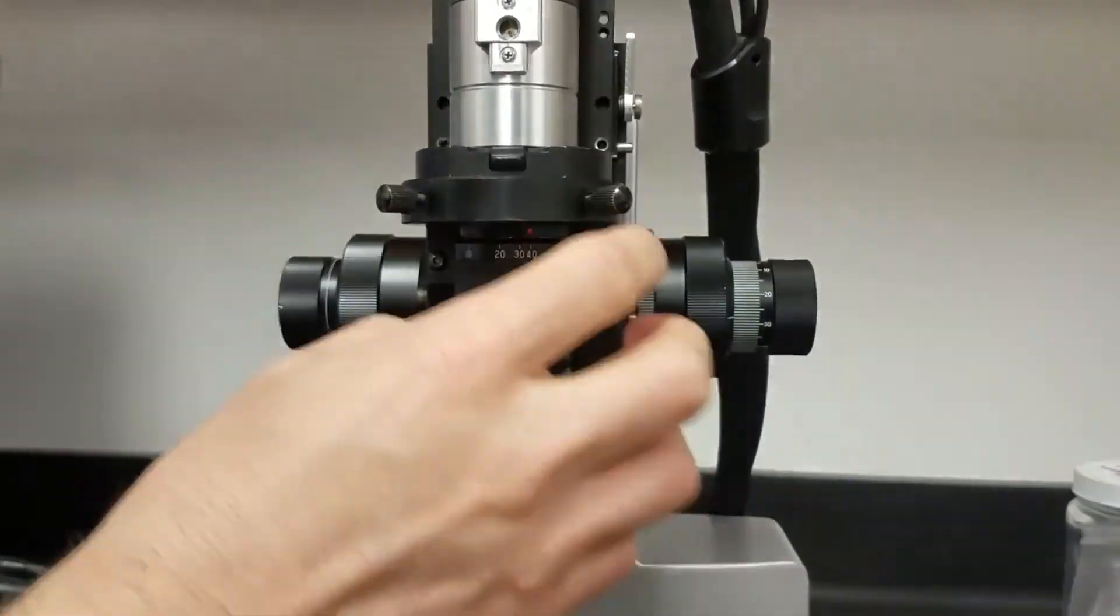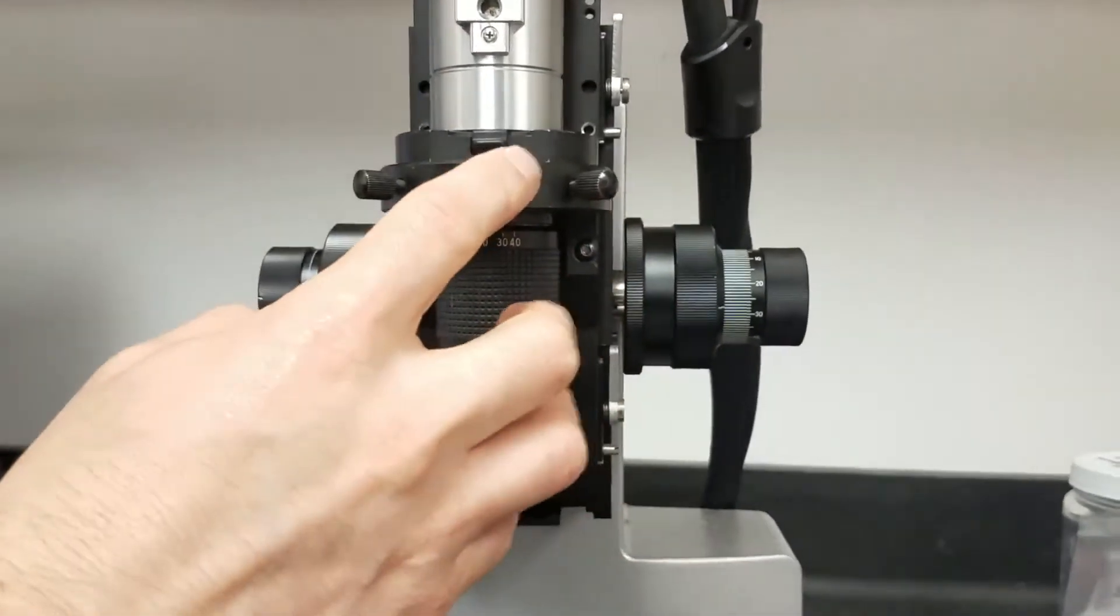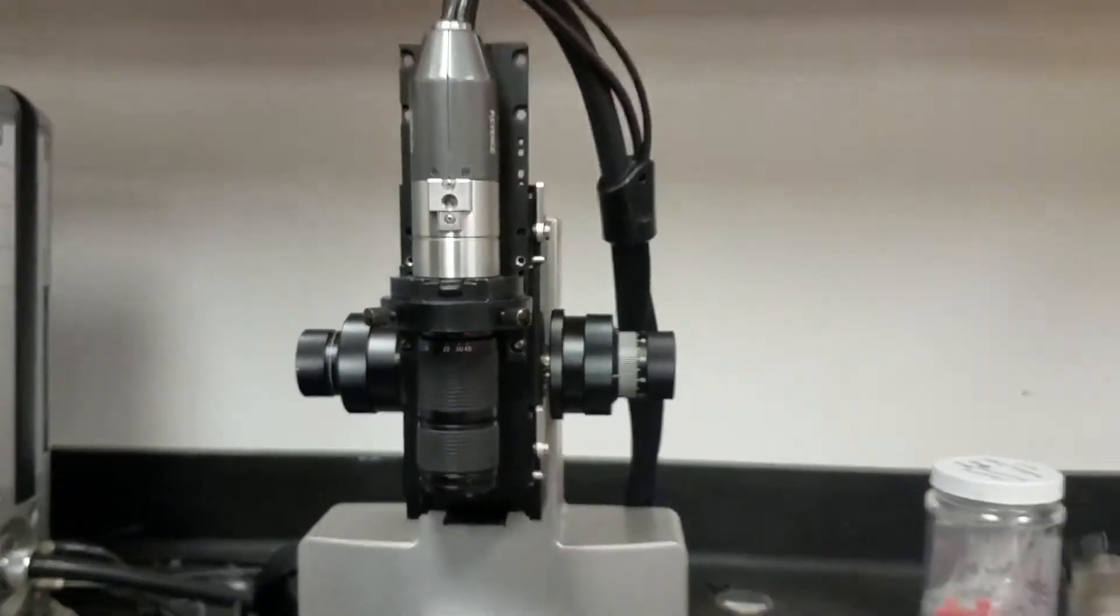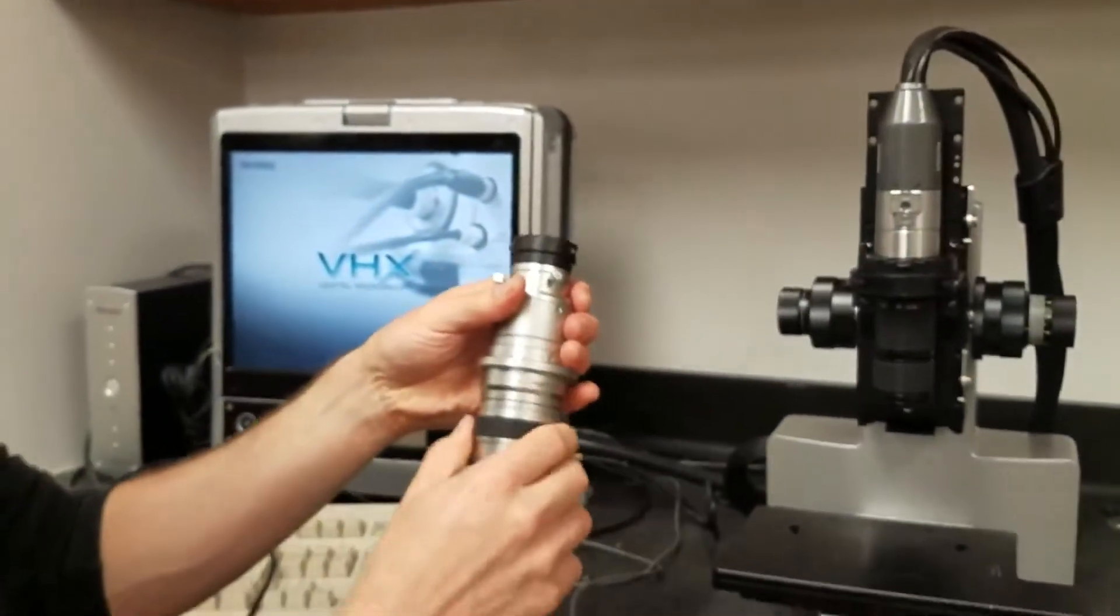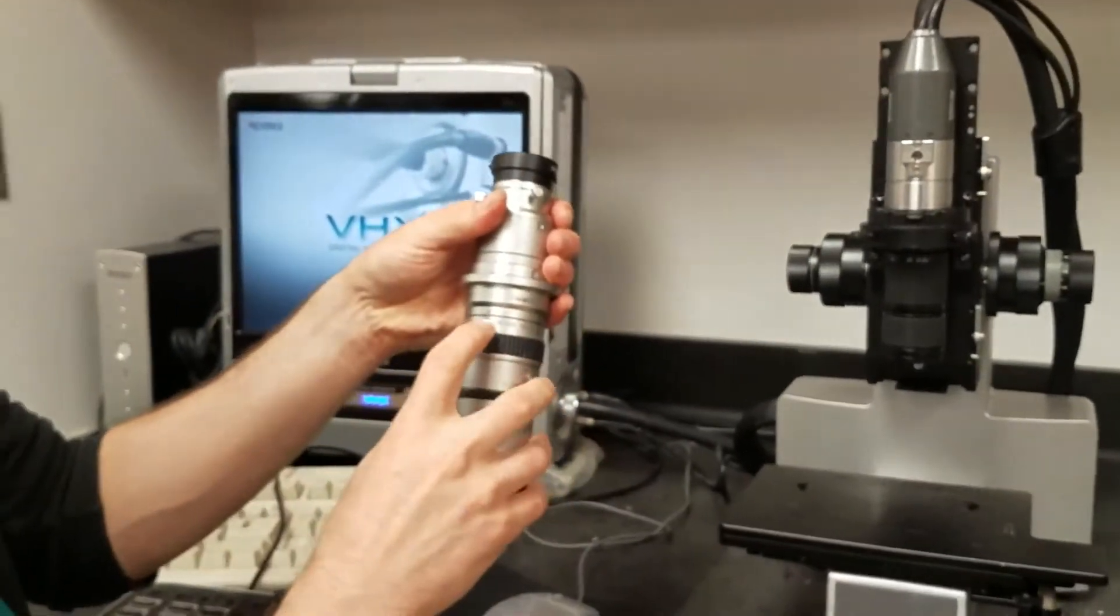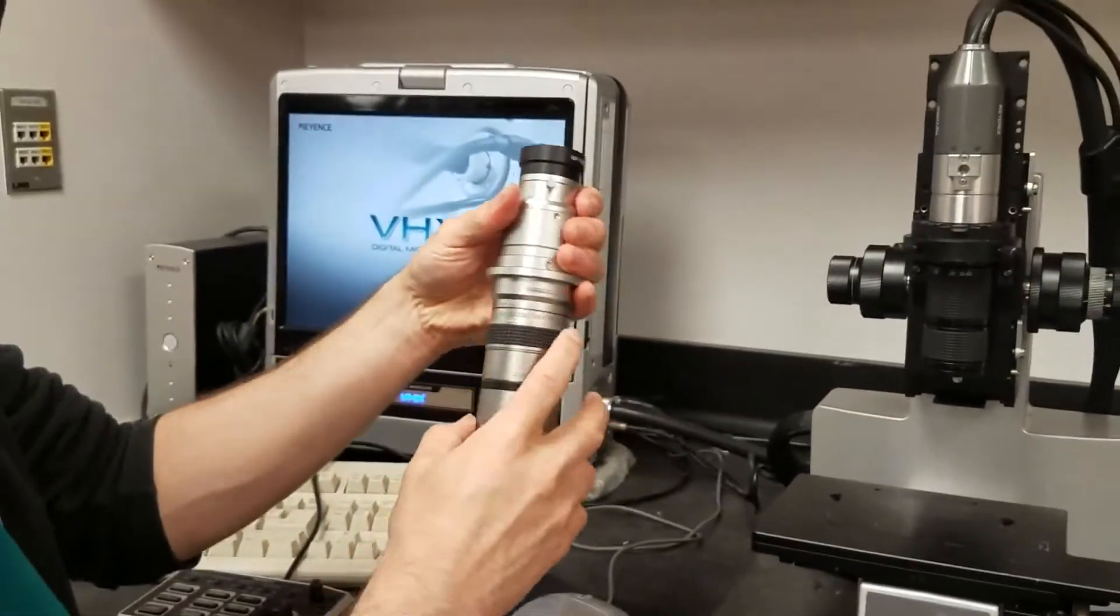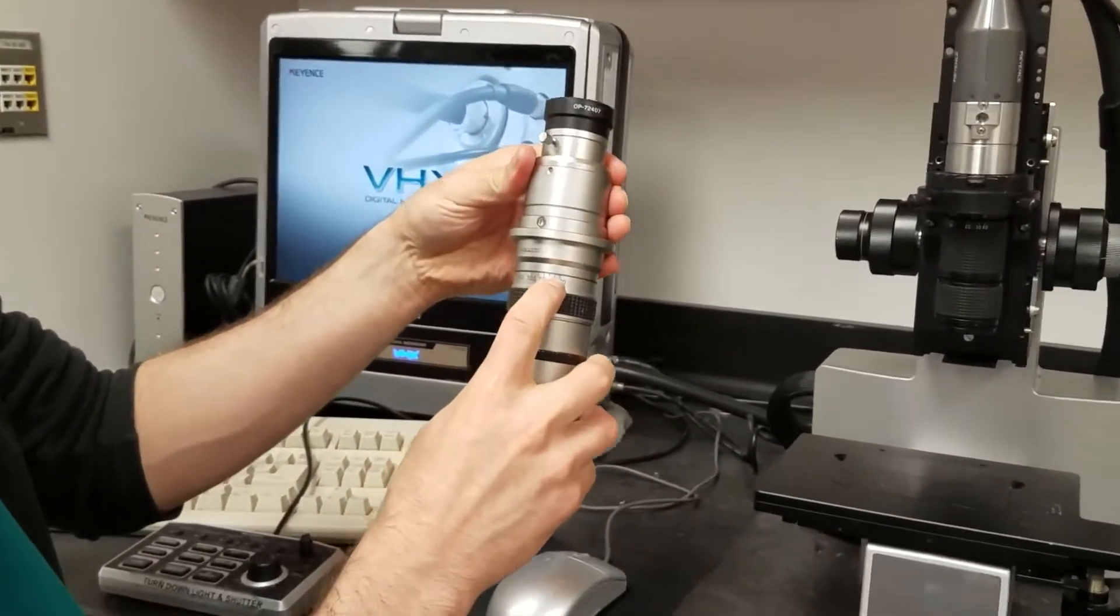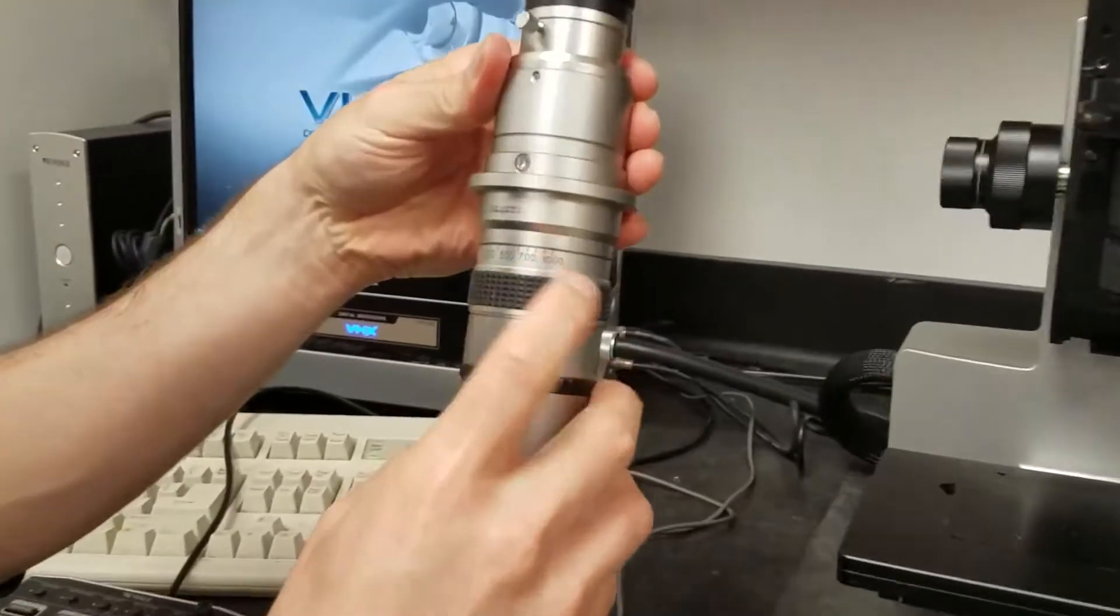And there's another lens, which I'll show you in a second here, that goes between 100 magnification and 1000 magnification.